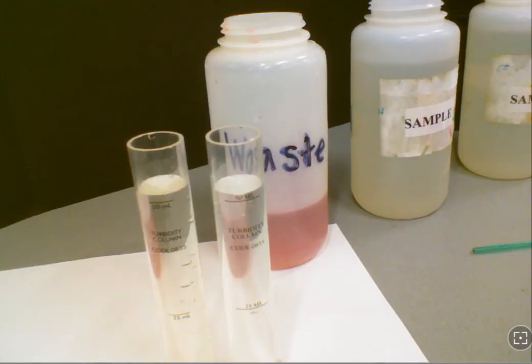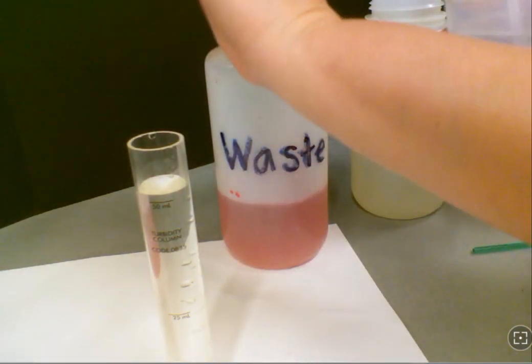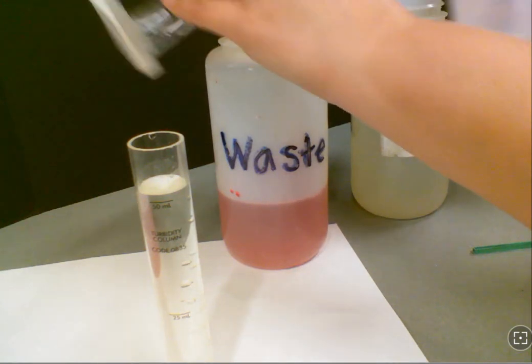Because this test is fairly quick, you will be doing a sample B test next. So you'll clean up your materials, and you'll go ahead and repeat this entire test to do your sample B test, and then record those results to your data collector.